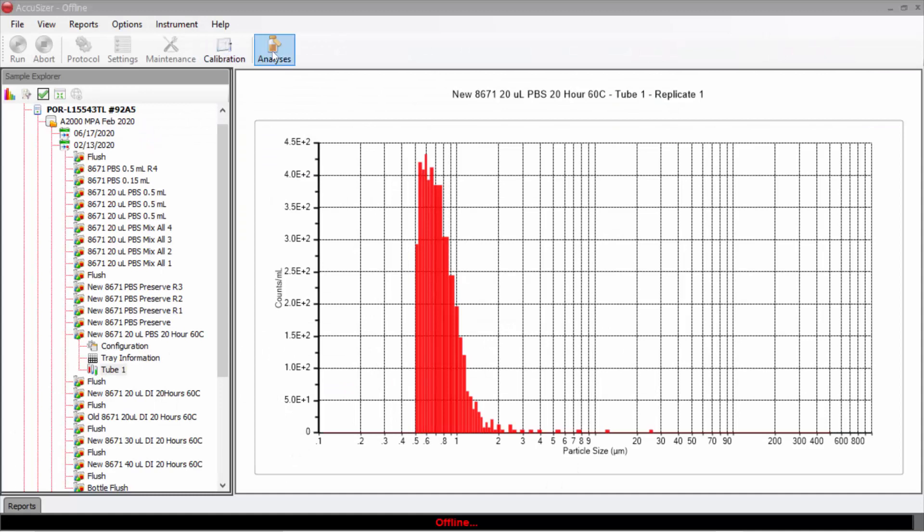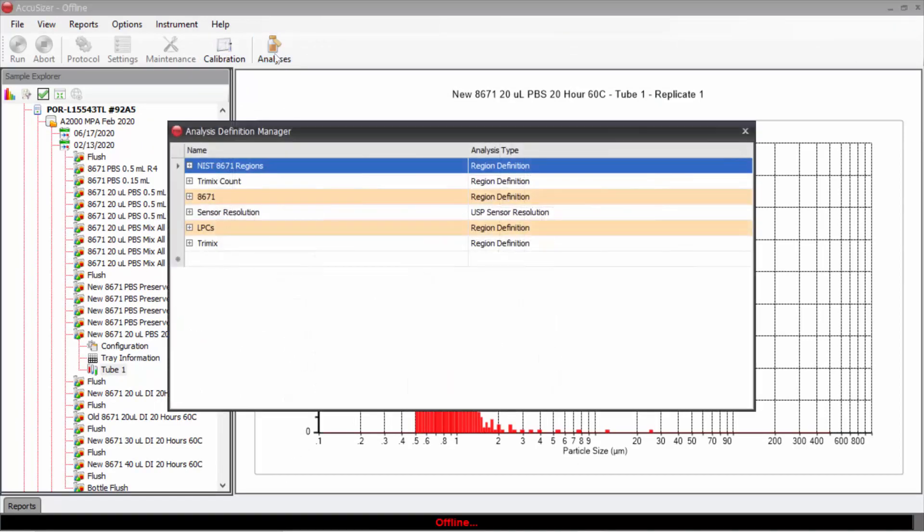To begin, we'll click up here on analyses, and here we see the analysis definition manager dialog box. Here are some of the analyses regions I have already created.